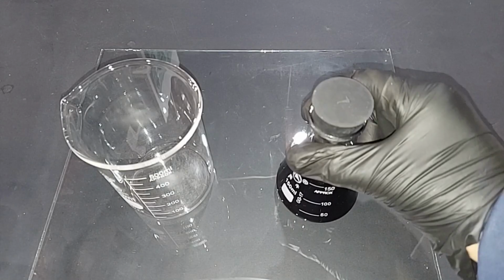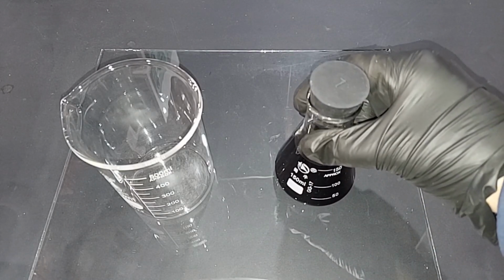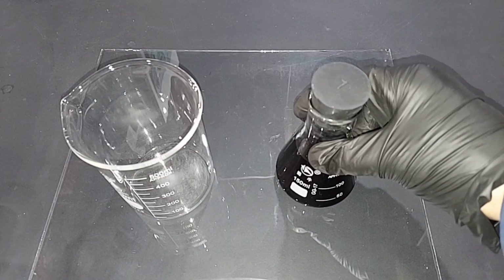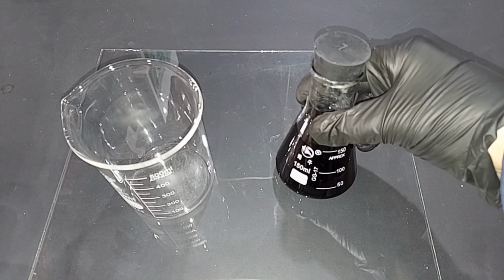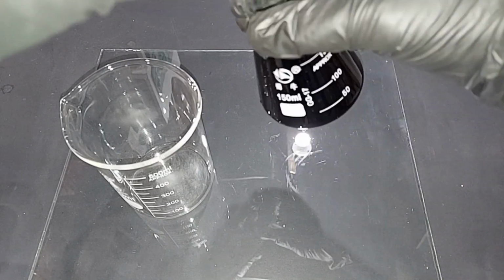Here's the 160 milliliters of the original solution that we separated earlier, and as I stated, I do believe there to be some copper 1 chloride in there, but we're going to produce it in larger amounts by dropping the chlorine levels in this so quickly that it really favors only copper 1 production, and I'll do that by loading a bunch of distilled water into that.